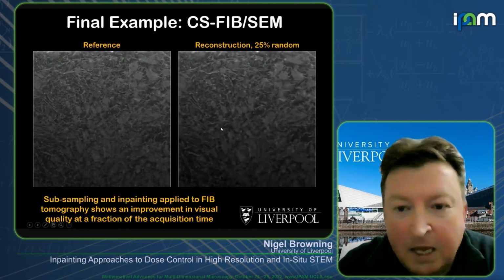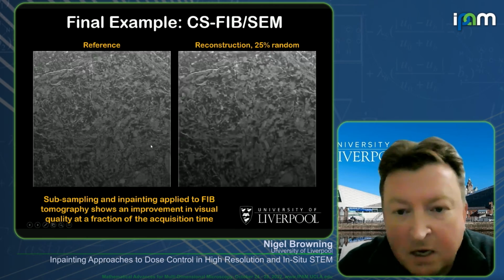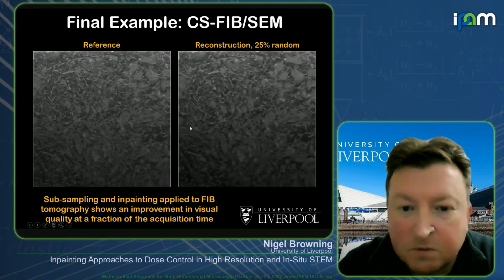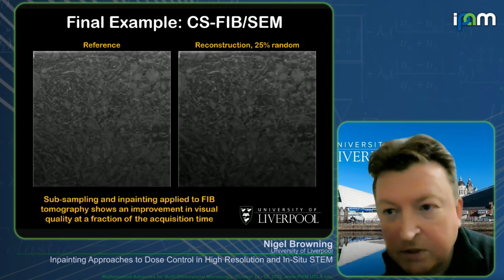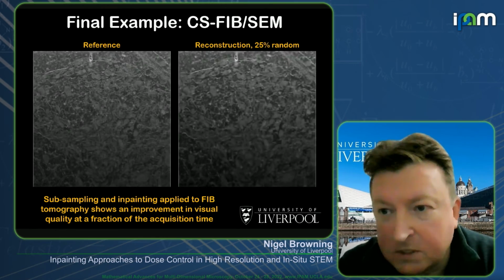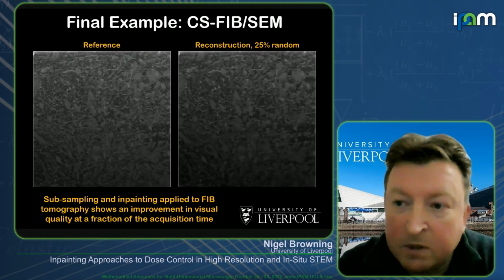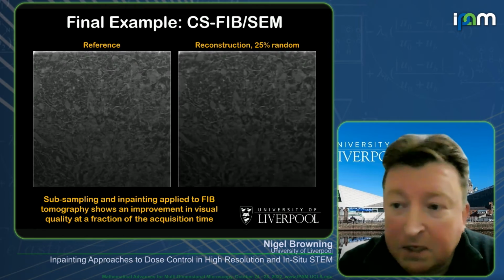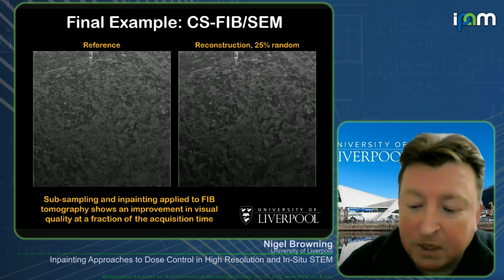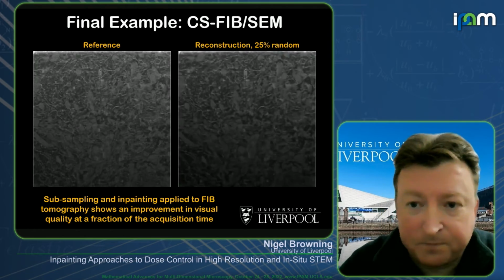It was more about looking at the fidelity of the reconstruction and the fact that we can denoise the data set as well with our random sampling to go through it. Now, in this case, we are just reconstructing each slice as a 2-dimensional reconstruction, but actually we should get increased precision on a lower data set if we deal with it as a 3-dimensional reconstruction, which is the next set of data that we're moving through.